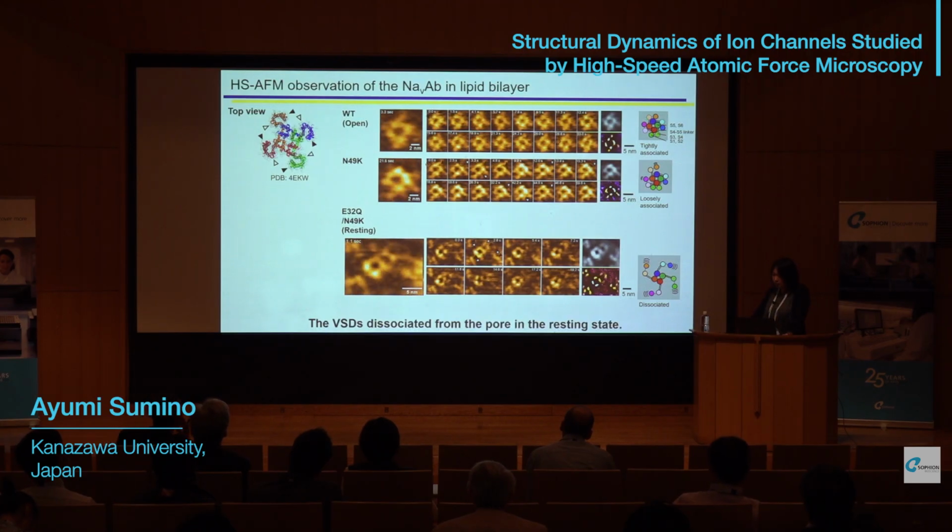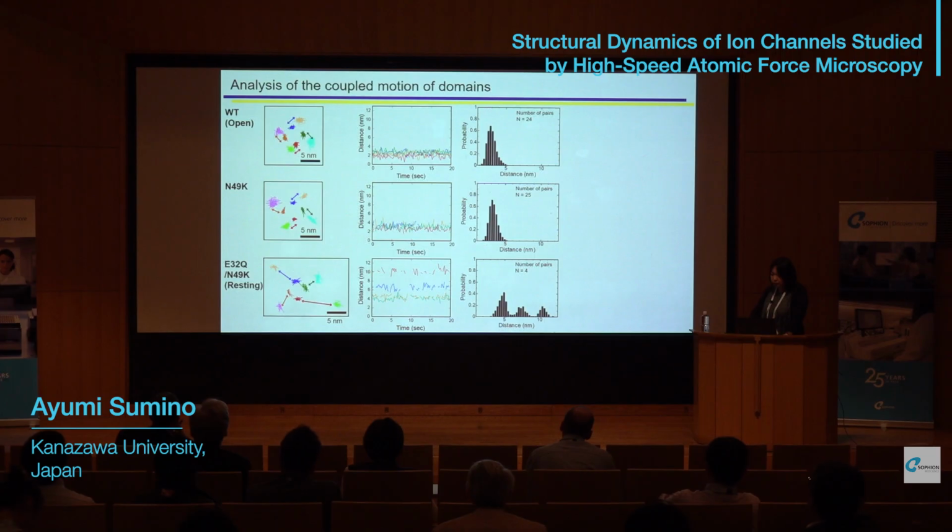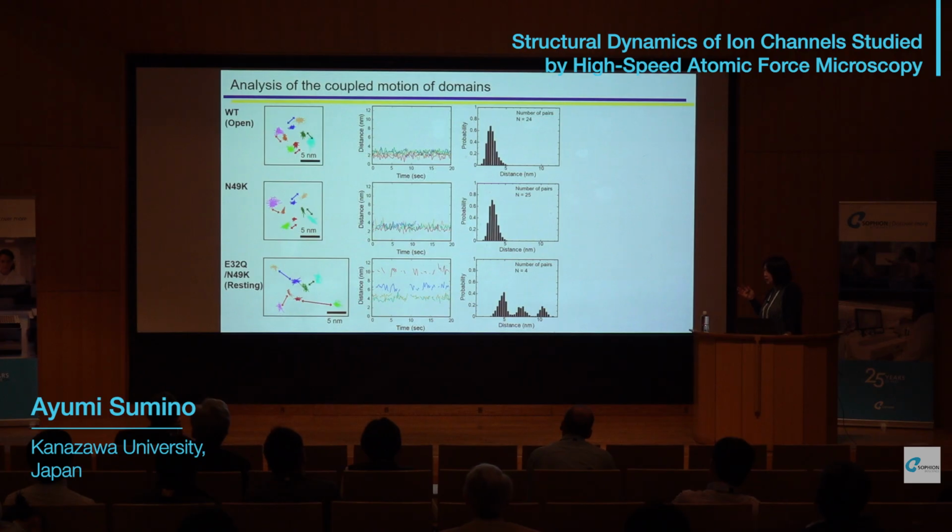So here is a schematic illustration of the result. By using high-speed AFM, we found that the voltage sensor domains dissociated from the pore only in the resting state. And here we analyzed the trajectory of each pore and the voltage sensor domains. These are the trajectories.